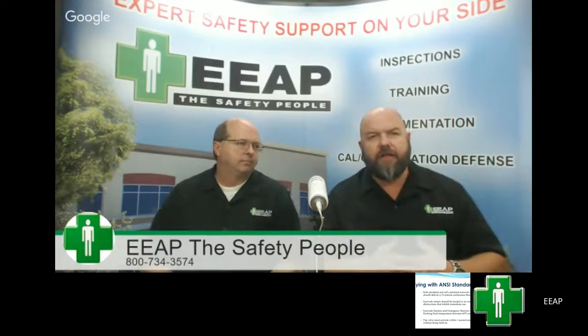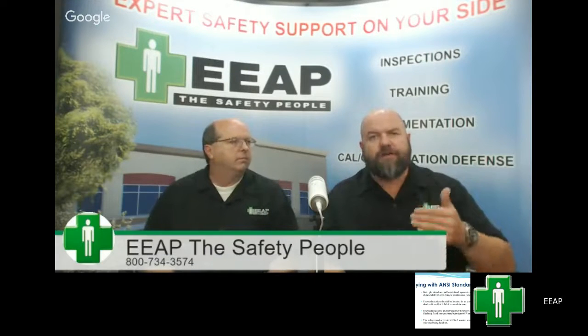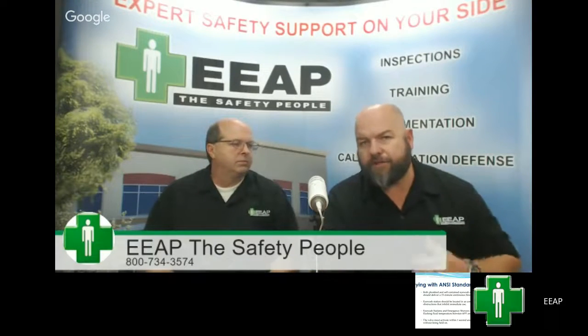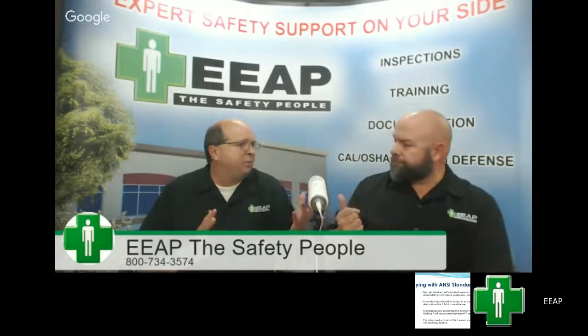I just think they're a waste. But you may feel differently, and there is no Cal OSHA law that says you cannot have them up. Let's make that clear. There is no law that says you can't have them up. You just have an eyewash station that complies. And so I'm just saying let's get them to the one that complies right out the back. Now, it's just a vulnerability issue, basically.